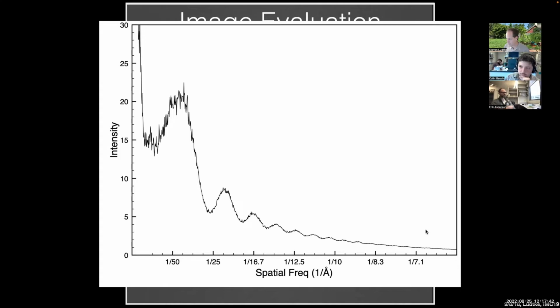Unfortunately, there are some pretty fundamental flaws with that assumption. First of all, while it is absolutely true that shot noise is uncorrelated, it is not at all true that you can take correlated noise and flatten it and produce uncorrelated noise. It is a logical flaw, but it is considered to be a weak enough flaw that it's a good enough approximation that they can get away with it. And it's true to an extent.